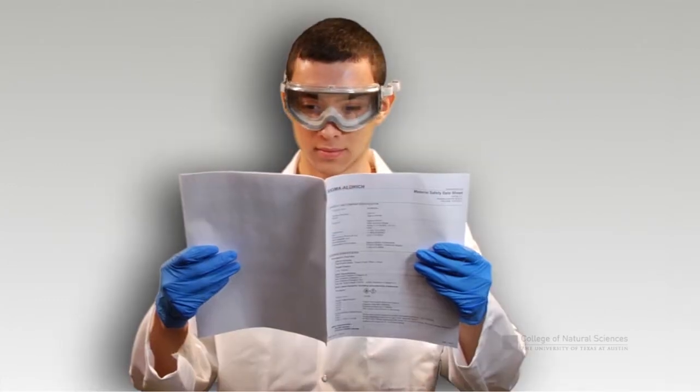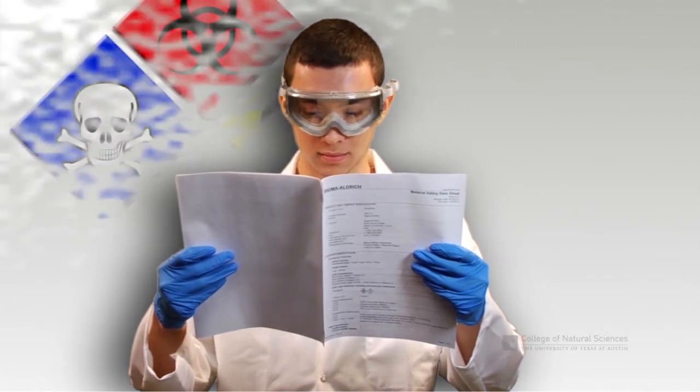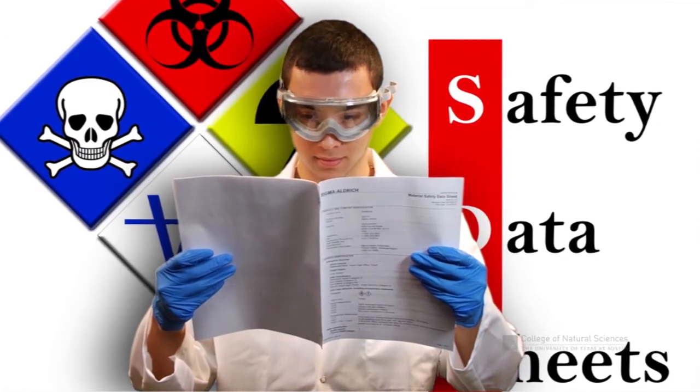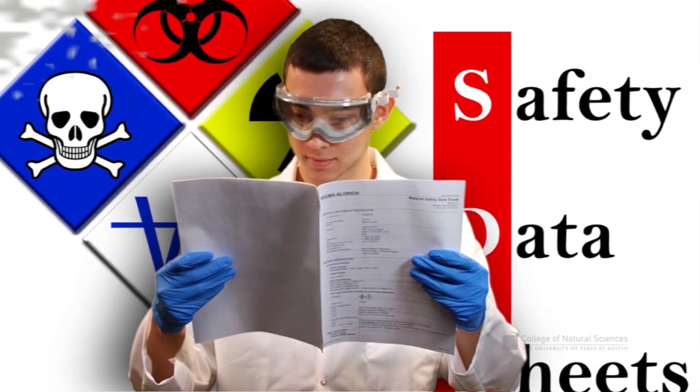Chemical and biological spills can pose a large safety hazard for you and others in the laboratory. You should read the SDS for all biological and chemical compounds that you will be working with. The SDS will contain information regarding how to handle a spill and whether special precautions need to be taken.